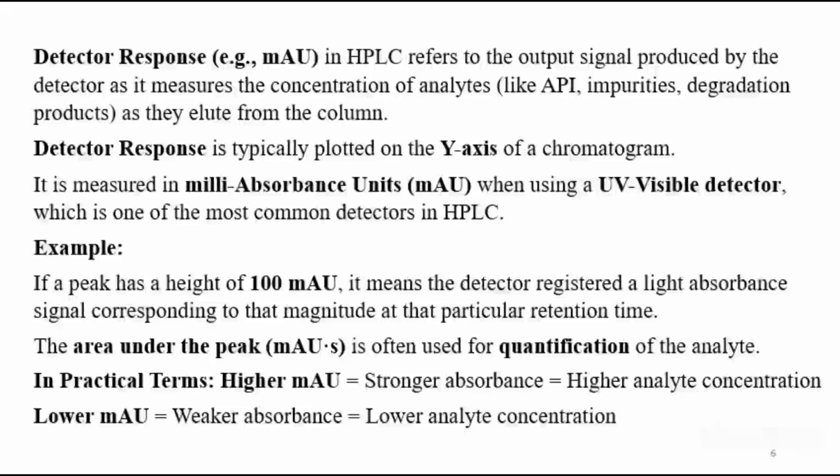The area under the peak is often used for the quantification of the analyte. In practical terms, we will understand the higher and lower detector response.